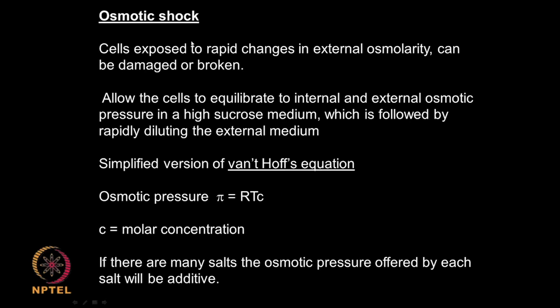You can have osmotic shock. What you do in osmotic shock is you move the cells from a certain osmotic pressure to another osmotic pressure. During that process water may enter the cells and it may break them. Osmotic pressure is based on the Van 't Hoff's relation. If you remember, pi equal to RTC, T is the temperature, R is the gas constant, C is the concentration of the salt in molar. So, we can calculate the osmotic pressure for any given concentration of the salt.